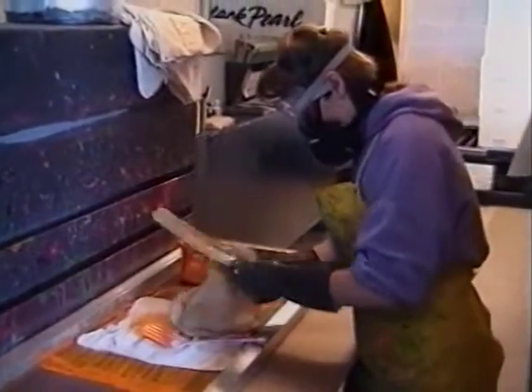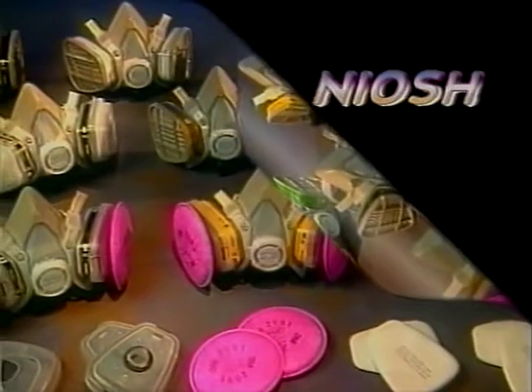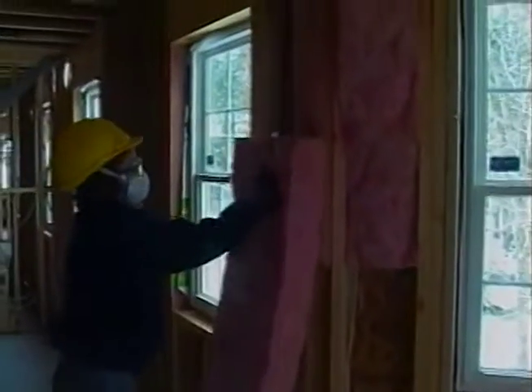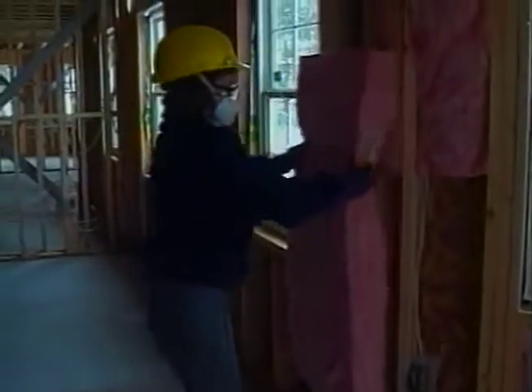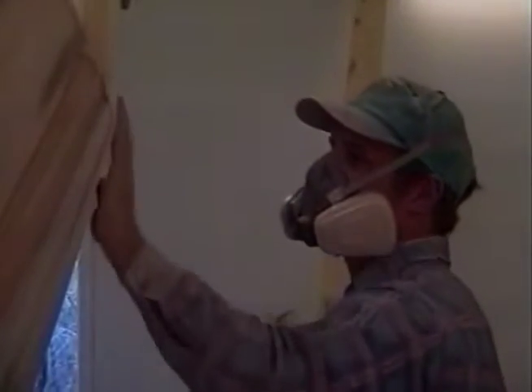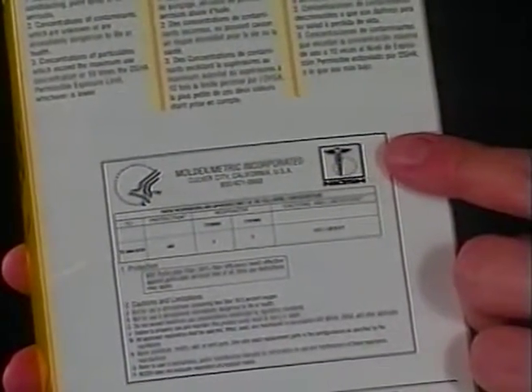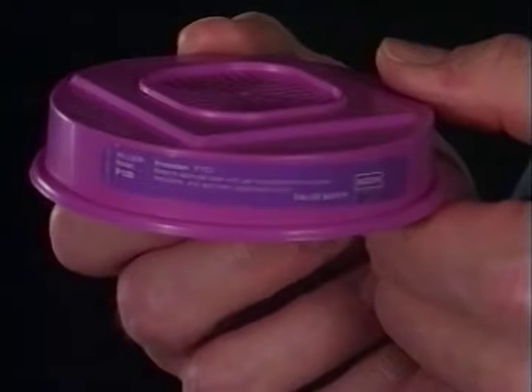Only disposable or reusable respirators that have been approved by the National Institute of Occupational Safety and Health, known as NIOSH, or an equivalent, can be used in New Brunswick. An approved respirator ensures that the user is provided with adequate protection if used properly. When a respirator is approved by NIOSH, an approval number is issued. In most cases, the number and the approval stamp are printed on the side of the respirator box. The NIOSH stamp is also shown on the disposable respirators and on the filtering cartridges of reusable respirators.